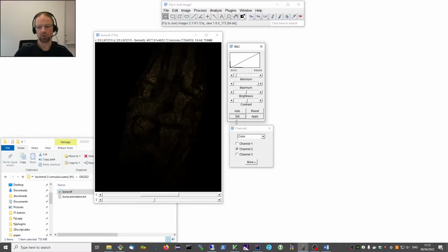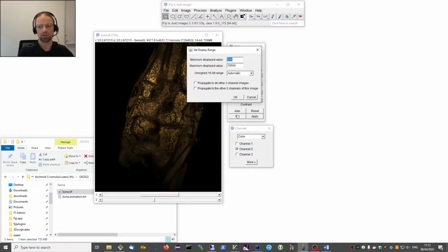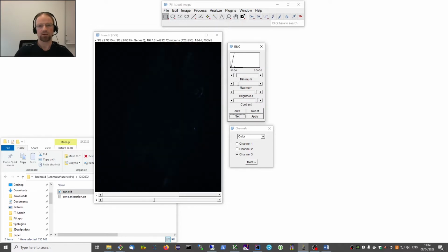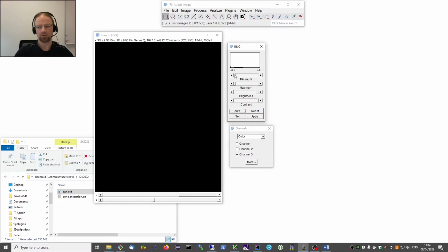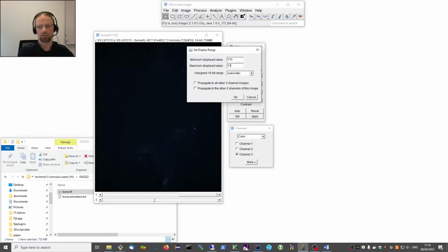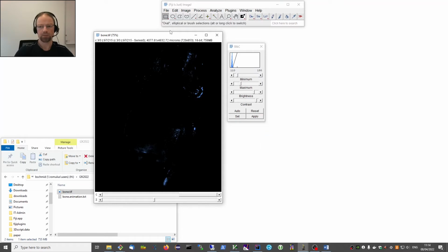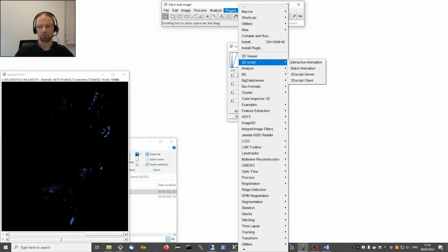So the second channel is quite dim. But I also would like to get rid of some of this background here, so I will increase the minimum a little bit. And the third channel is actually quite weak, so you can see that the signal is very noisy here, so this gives me a harder time to adjust it well. But I think this should work nicely now. And so let's put this to the side. And now we are ready to open 3Dscript.